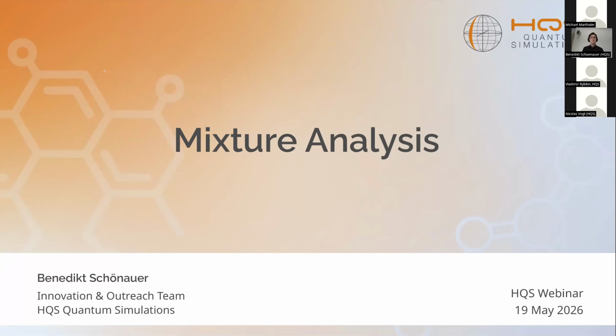I'm yet another member of the Innovation and Outreach team, and I'm going to show you how we are now using all of this data that we analyzed and pre-processed before in mixture analysis based on one-dimensional NMR spectra. That is an interesting and very practical problem. It means if we're given an experimental spectrum from somewhere, let's say off the internet, can we determine what is in this mixture? And ideally, can we determine how much of it is in the mixture?